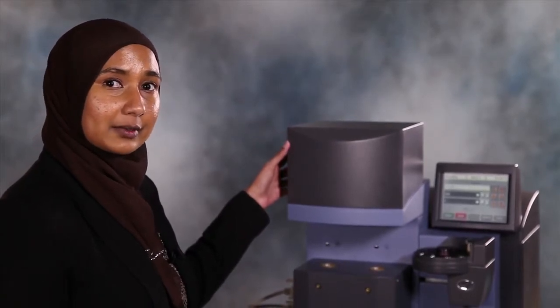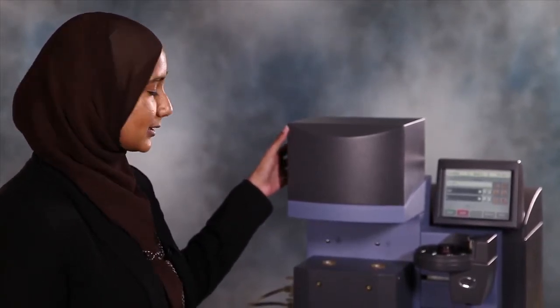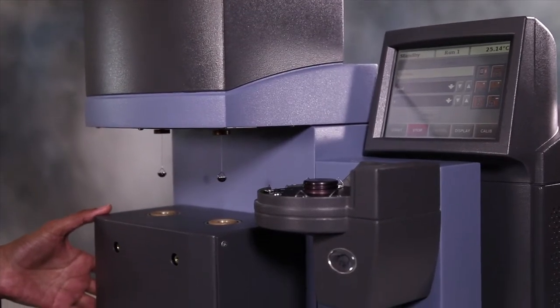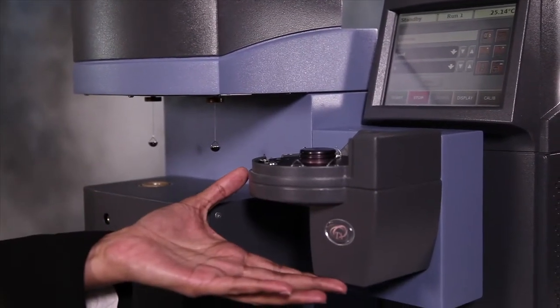The Q5000 SA Sorption Analyzer is made up of three main components: the thermal balance, the humidity sample chamber, and the 10 position auto sampler.